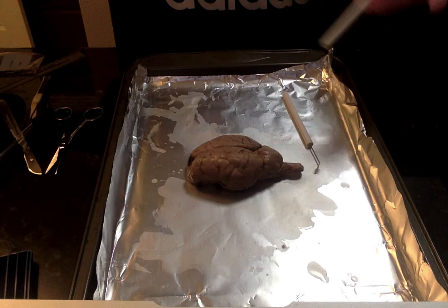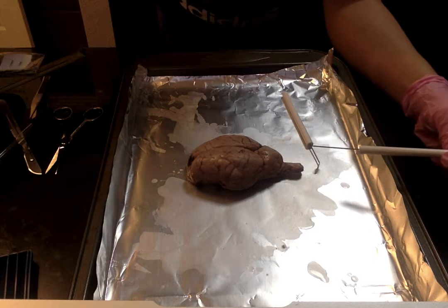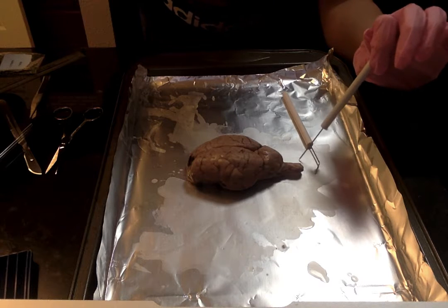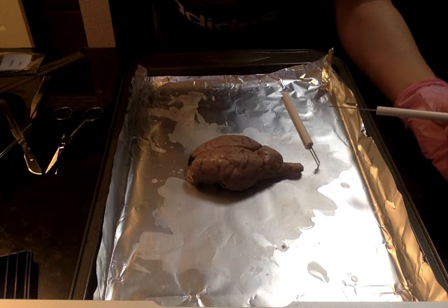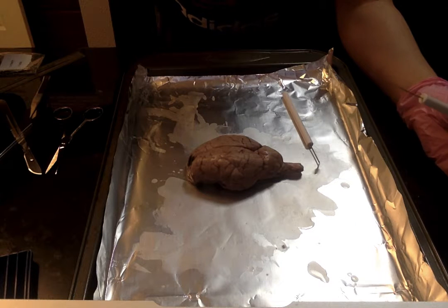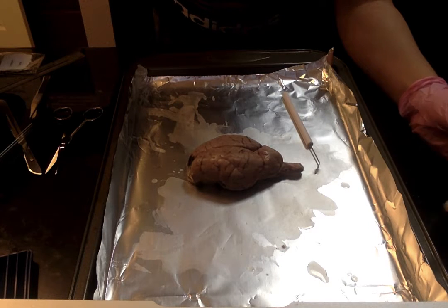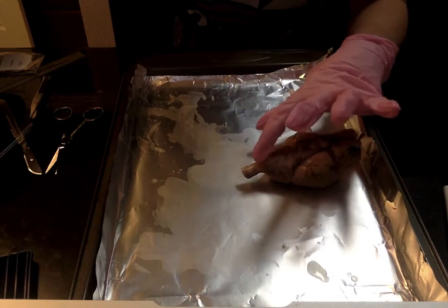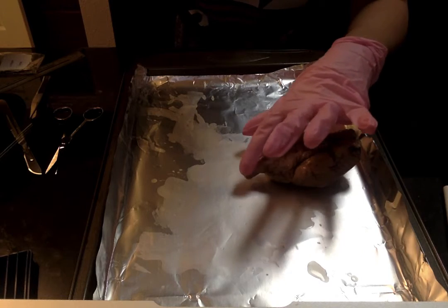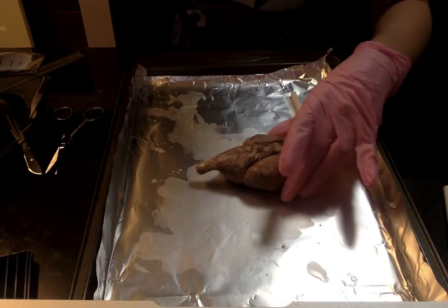So starting off, we're going to see the spinal cord, which is resting on the pan. It is a long cylinder of nervous tissue which extends from the medulla to the first lumbar vertebrae and is like the information highway for communication between the brain and the rest of the body. So the medulla is going to be on this side, right around this area, and this is the spinal cord, and this is where it would lead into the rest of the body.